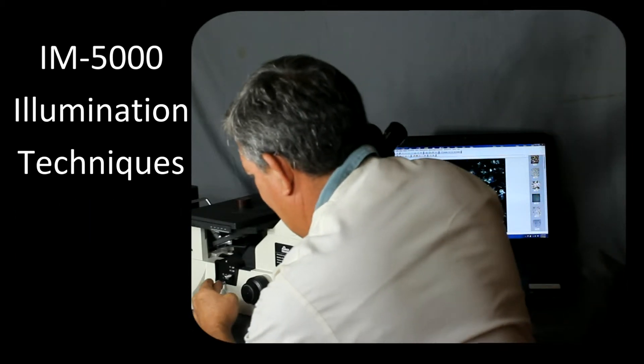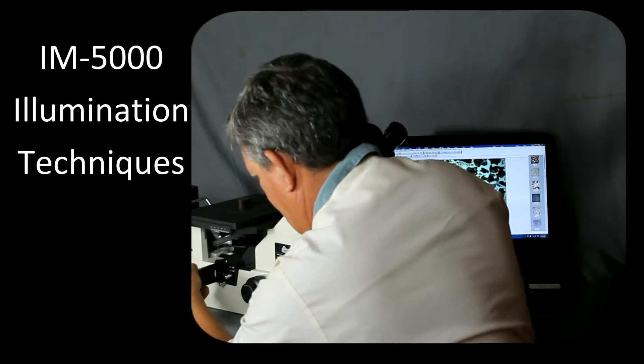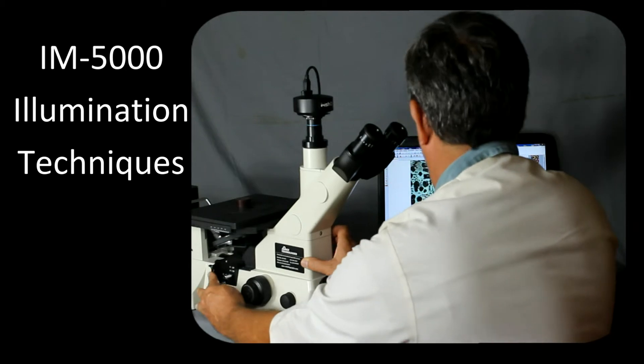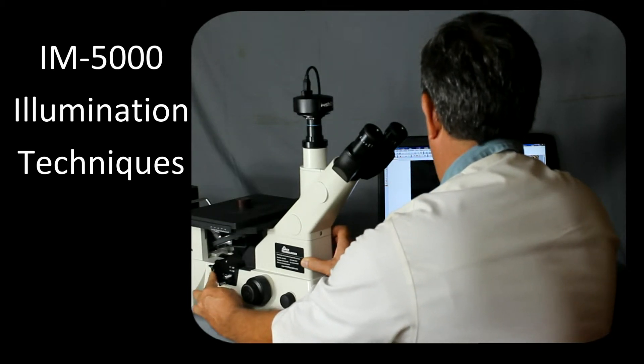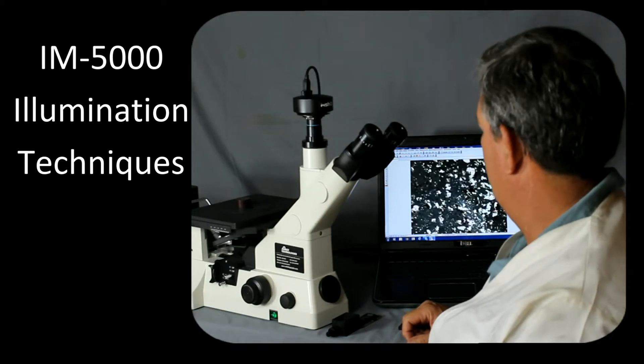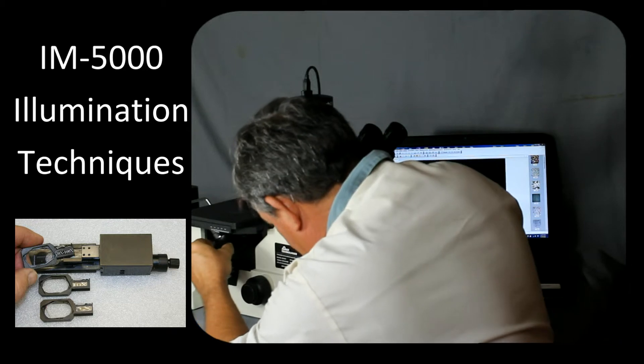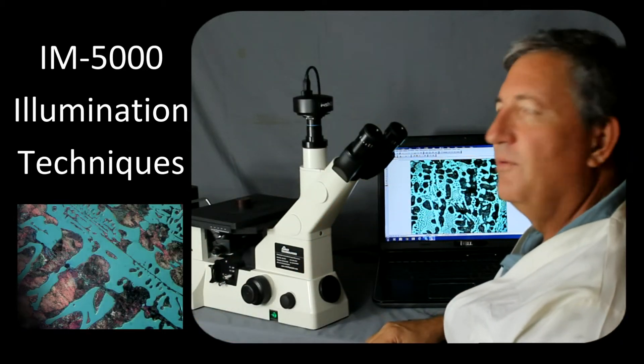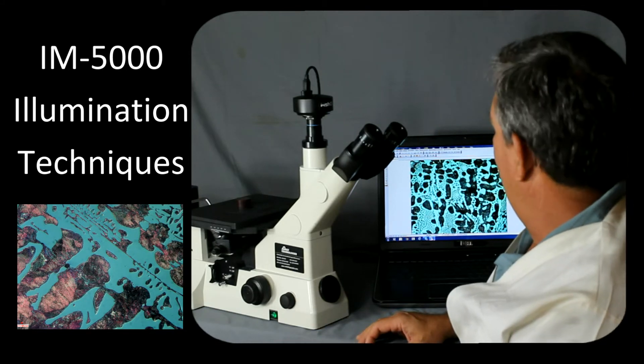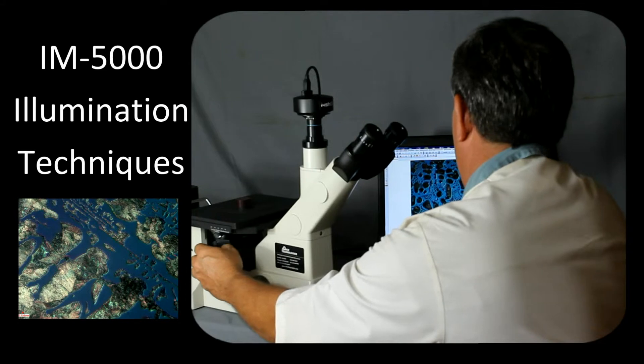Differential interference contrast uses an analyzer and a polarizer. Here's the polarizer here, and then here's the analyzer here. So what we do is we adjust the analyzer so that we are near extinction, which means that the image is going to be mostly a blacked out type of image. From that point what we do is we add the Nomarski prism, which slides in here. You see with the Nomarski prism, what happens is that we get more of a three-dimensional view because we're shifting the phase of light just slightly. And not only that, but we also bring out a variety of colors. So by rotating the prism, we can see we can get a wide range of colors in our photographs as well.